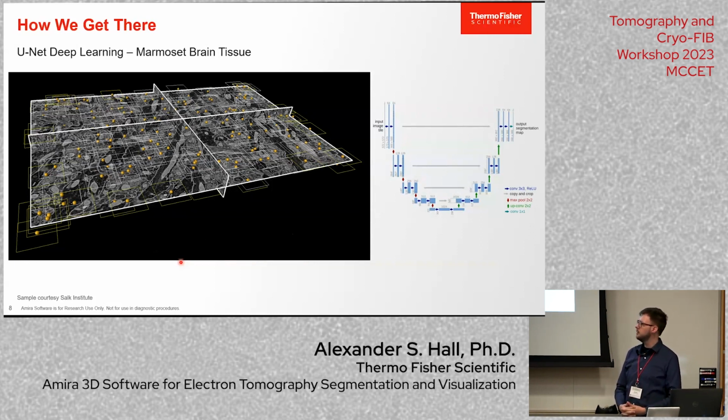And in order to provide ground truth that are from throughout the sample, I placed landmarks that are shown with those dots, and there's squares you'll notice expanding out from them. These are the actual locations of data that I pooled together to produce ground truth information. This is really relevant for the biology domain because our samples are not homogeneous, right?